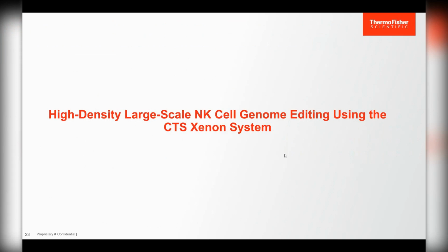However, you can see here, NK cell therapy in the previous section, we edited the NK cell on a small scale, and now we are interested in high-density or large-scale NK cell genome editing. NK cell therapy requires a large number of NK cells per therapy dose, and multiple doses are required. One of the key challenges faced by the cell and gene therapy industry is high-efficiency NK cell genome editing on a large scale.